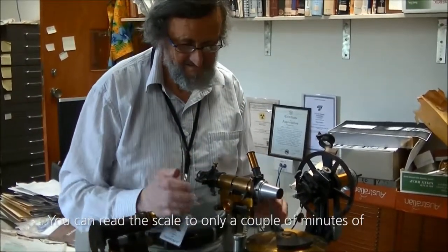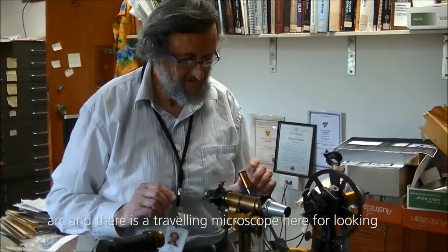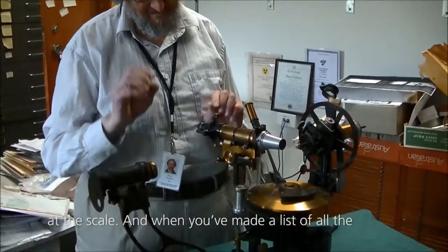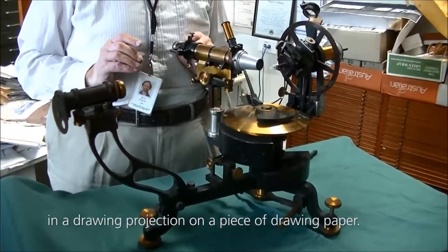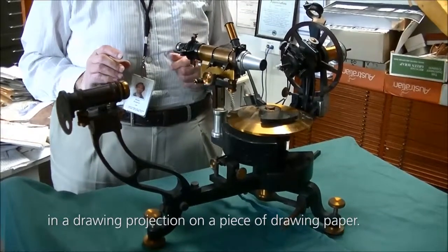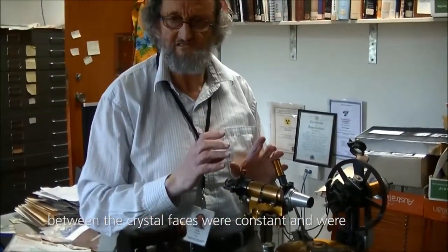You can read the scale to only a couple of minutes of arc, and there is a travelling microscope here looking at the scale. When you have made a list of all the angles of the faces, you can reconstruct the whole crystal in a drawing projection on a piece of drawing paper. This was used in publications, and the angles between the crystal faces were constant and representative of that mineral.